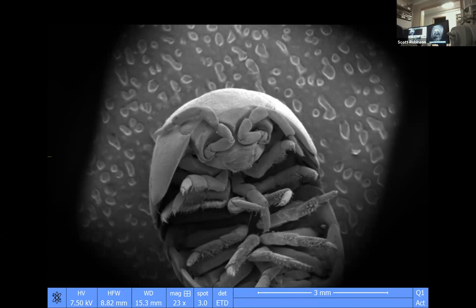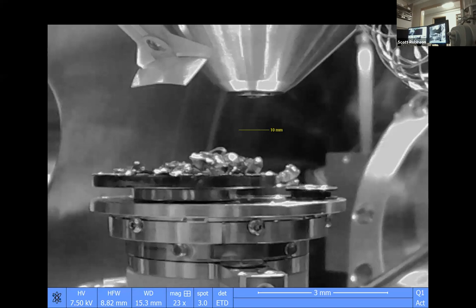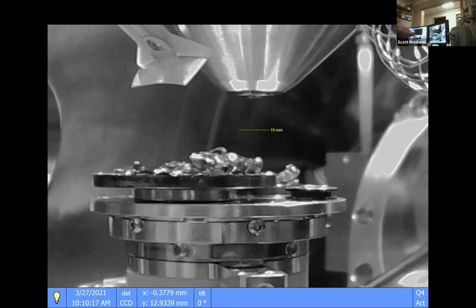And we can see what the inside of the chamber looks like. There's a conical part at the top, and that's where the electrons are coming from. They're coming out of there, and they're rastering across the sample the same way that a TV works. And you can see the sample in there. The camera is not nearly as nice as the electron microscope image capability.